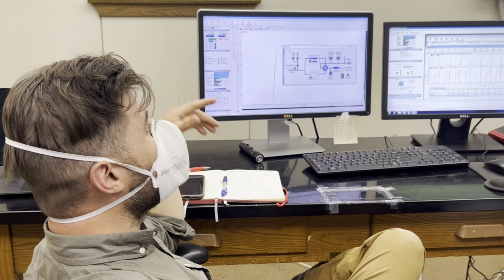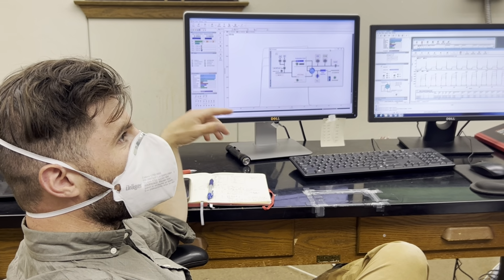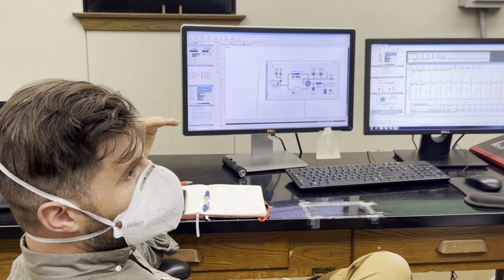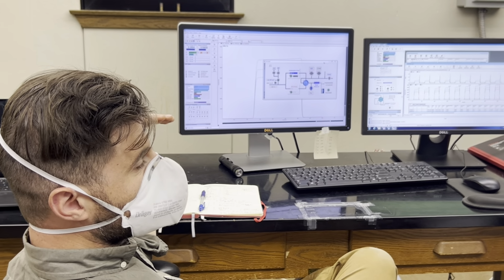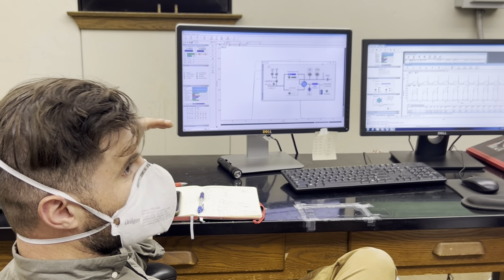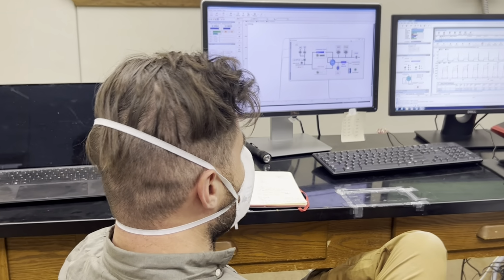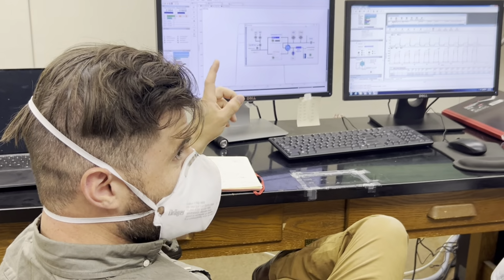That is a known. So at that point you'd know that there is a linearity problem. So it's just checking that there's no variability based on concentration, no variability based on the voltage, which would be concentration. There's always going to be some, but there's a limit, and the limit is 0.066 per mil.